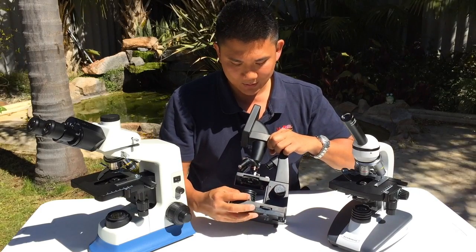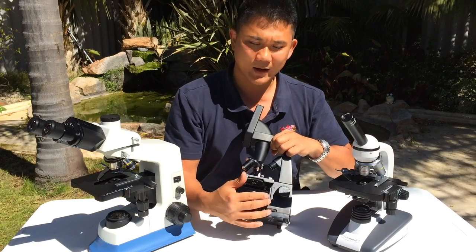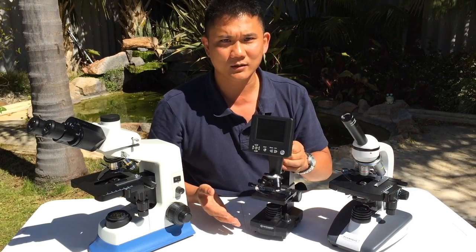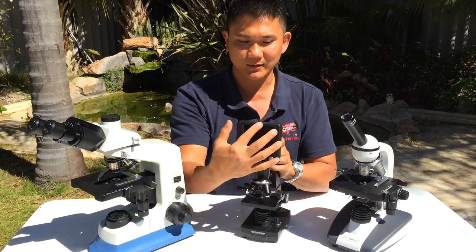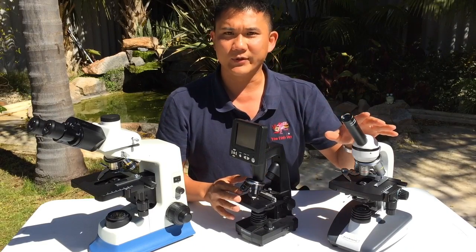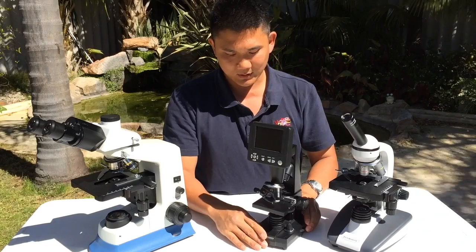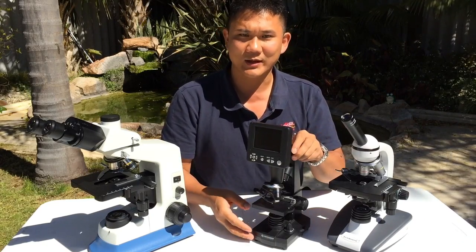It's also got light control so you can increase the intensity of the light. Something like this you can probably pick up for between one to two hundred US dollars. One disadvantage is that the field of view on the monitor is smaller than viewing directly down the eyepiece. Also, the base is a little small so it can wobble around, which is slightly annoying but manageable.